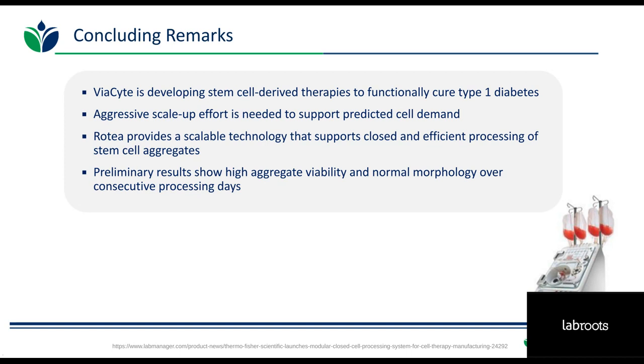Great, thank you so much. And our next question, why choose a suspension culture method, i.e. in general, what are the overall benefits you see in suspension culture versus 2D adherent methods for stem cell research? So the advantage of suspension culture over 2D adherent methods for stem cell production becomes really apparent as the stem cell expansion and differentiation process is scaled. Compared to 2D adherent methods, stem cell production processes utilizing suspension culture combine improved cell processing characteristics such as unlimited capacity for growth, so no surface area limitations, and then a lower aseptic risk with lower production costs, so reduced equipment footprint and labor requirements.